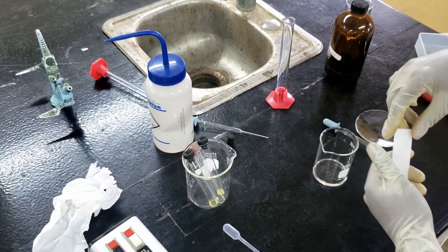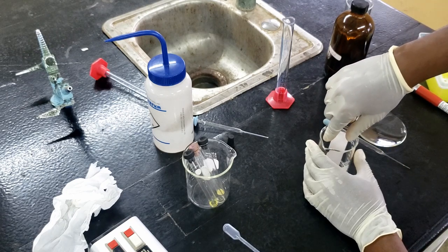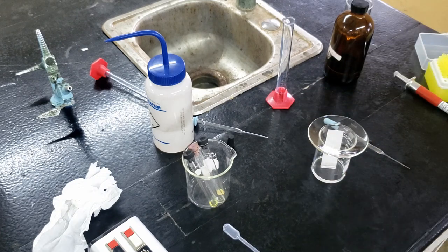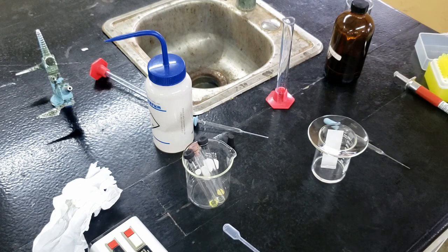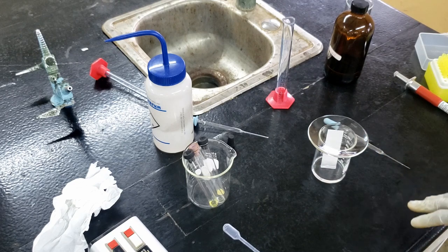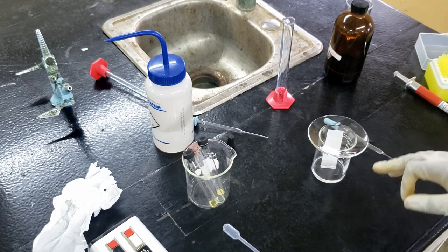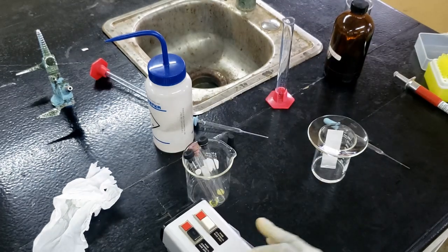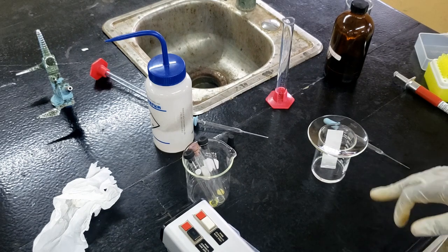Inside will go our TLC plate. We cover with a watch glass, and we just let that solvent move up the TLC plate. When it reaches about a half centimeter from the top, we're going to stop. And then we're going to measure the distance that each of the substances traveled and the distance that the solvent traveled. We have our UV lamp here prepared. Once the TLC plate has dried, we put it under the UV and we're going to circle the spots with a pencil.